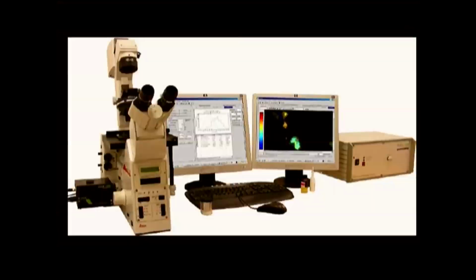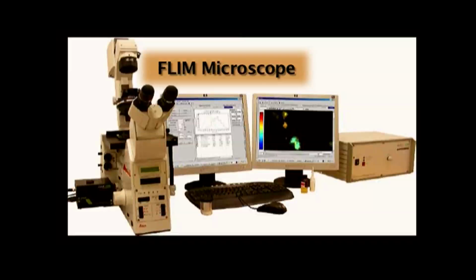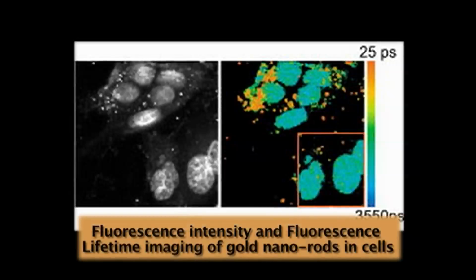Sir, what are the advantages of FLIM? The major advantage of FLIM, as I was saying, is that we are here studying the fluorescence lifetime of a particular fluorophore. So let's take an example. Let's take two different fluorophores at two different conditions in the cell. And the fluorescence lifetime is actually dependent on the boundary conditions, the things in the vicinity, and how the ions are present.